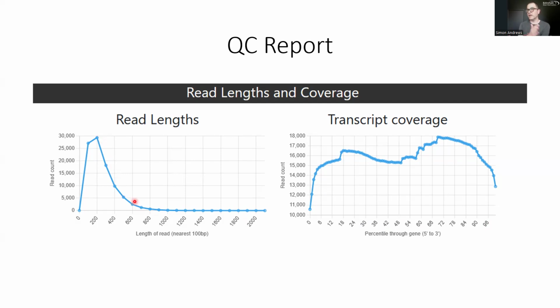Again, other libraries may give longer lengths. They will in the end reflect the lengths of transcripts in your data as well. So it doesn't really tell you how complete they are. It's just showing what's reported.